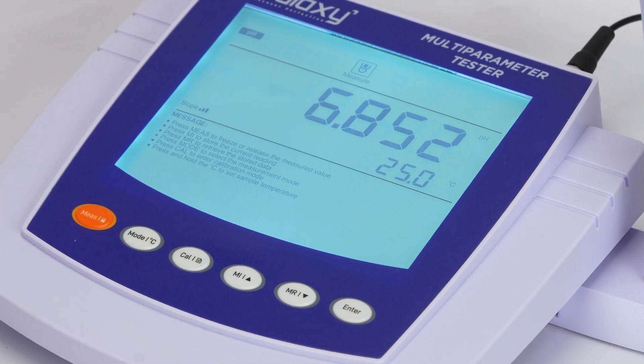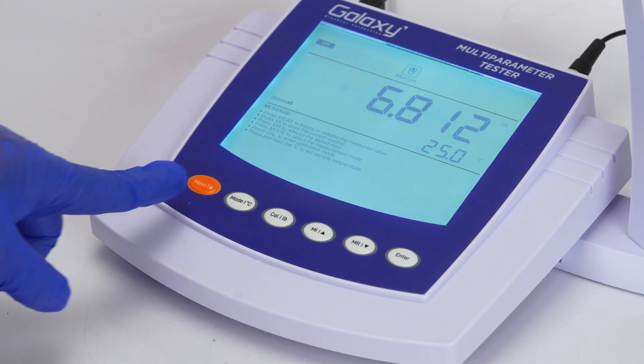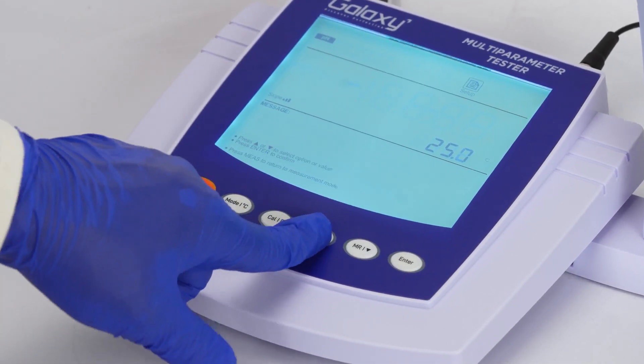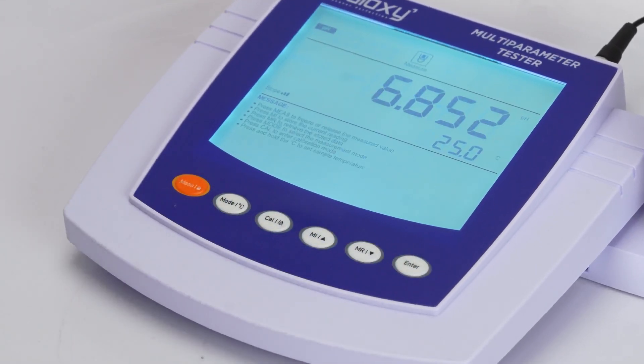If the temperature probe isn't detected, the meter switches to manual mode. Hold the mode key, adjust the temperature using the up or down keys, and press enter to save.